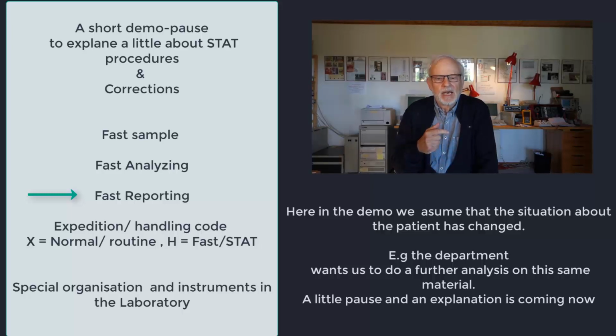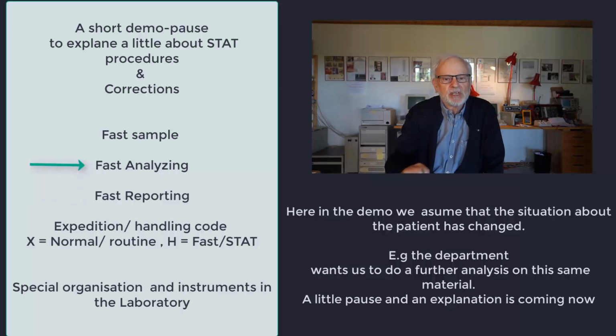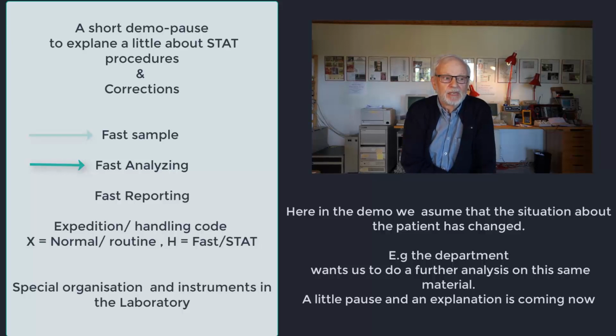Regarding analyzing, you can put the sample in front within the analyzing queue. But regarding sampling, you can try to organize, but you need a larger staff.